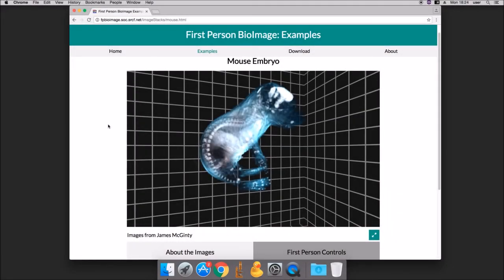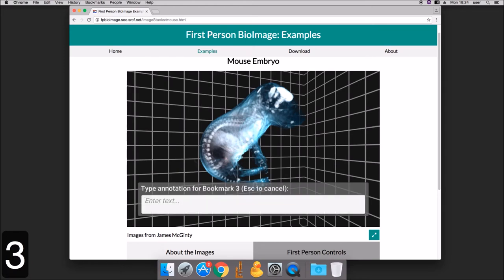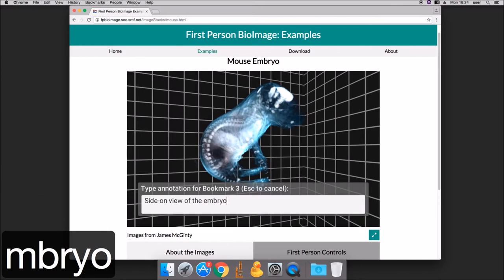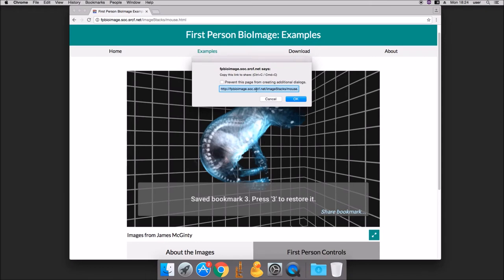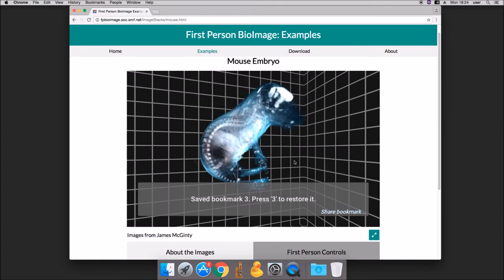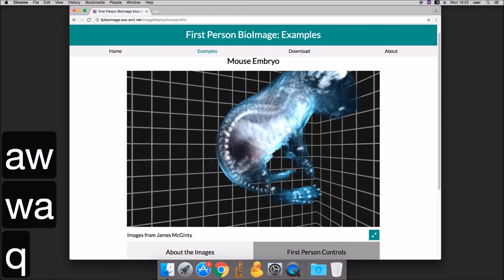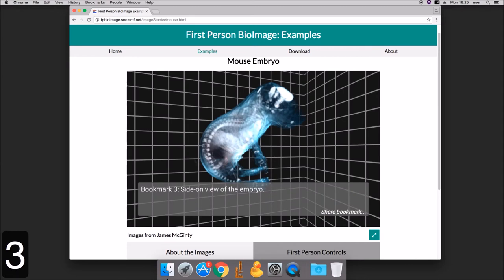To create a bookmark, press B followed by a number. Enter an annotation for your bookmark and press Enter to save it. You can now share your bookmark by pressing Share Bookmark. Make sure you copy the text before pressing OK. You can restore this bookmark any time you view the dataset by pressing the number corresponding to the bookmark.